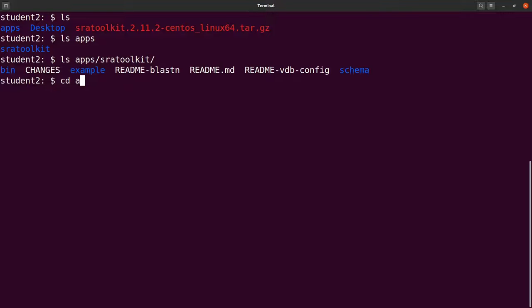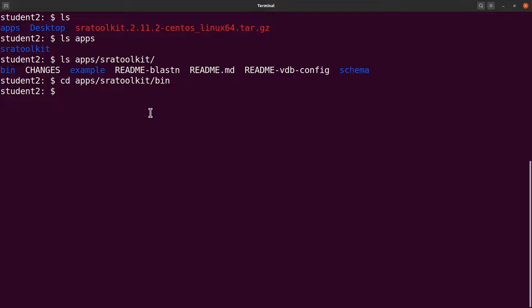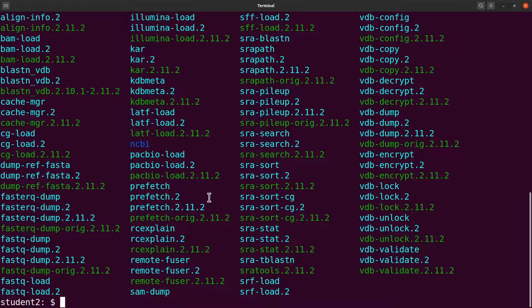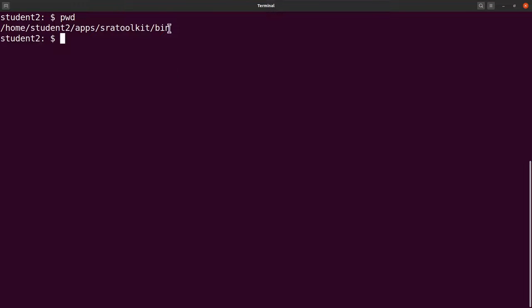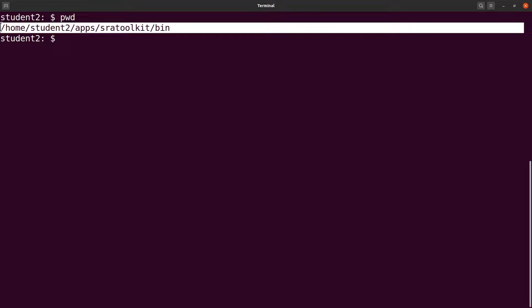Setting the PATH will enable us to use those commands without specifying the full path. I'll cd into apps/sratoolkits/bin. I'm taking it step by step since my viewers may be beginners. Let's do an ls and find the files there, then clear the screen.